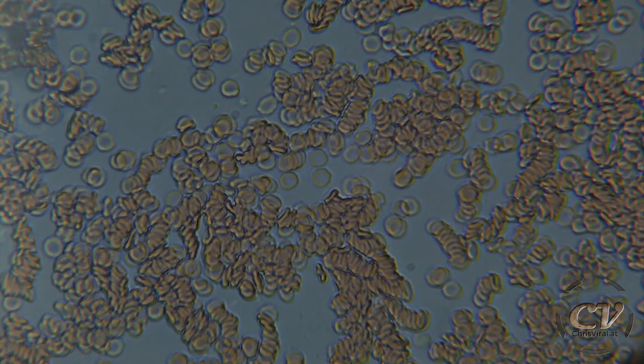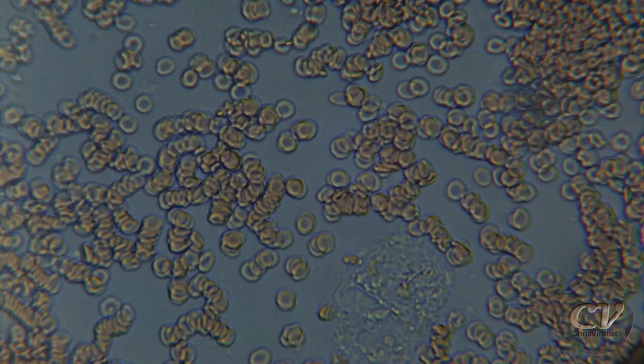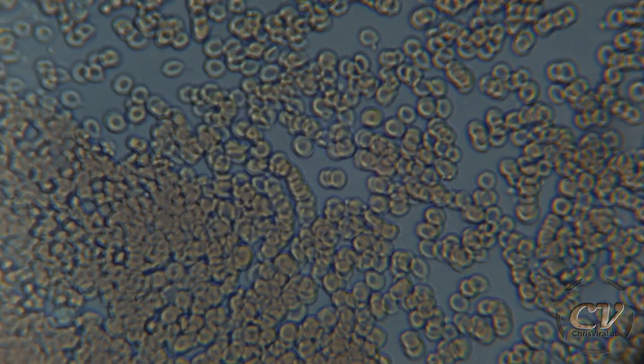So they are clotted up. This is pretty much the edge of the sample — somewhat dense. There we go, that's dense right there. It's still slightly moving there. That's the edge of the glass right there. There is a lot of blood — a lot of blood cells right there. Well, I'm already recording for 14 minutes, which might explain why it's stopping — probably just drying up. But where are they moving, like where are they concentrating? That's so weird.